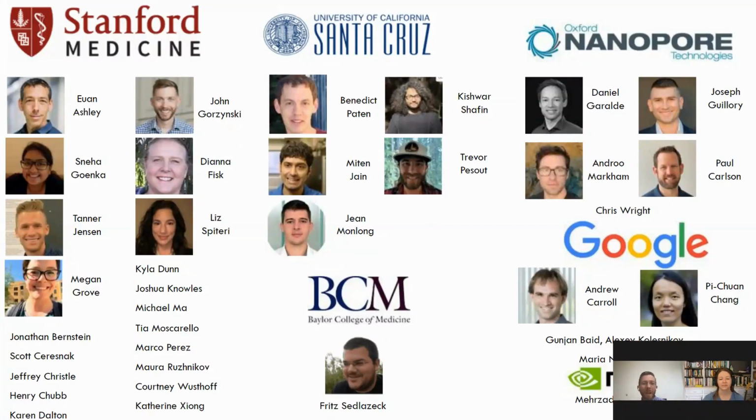genome. With that said, as you've mentioned, the MinIASM and Minimap is much quicker than Canu, and I think that there are a few more programs that have recently come out that are even quicker than those. So I think that's something that we certainly will explore moving forward. With that said, we're pretty confident that the variant calls that we make simply by aligning to a reference genome alone are good enough for our application.